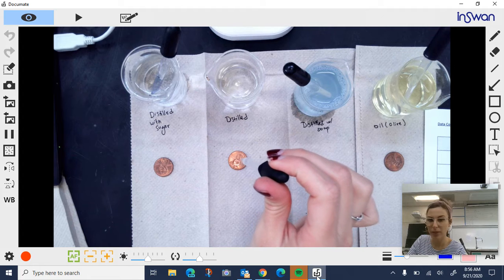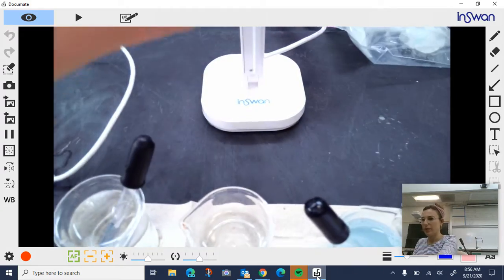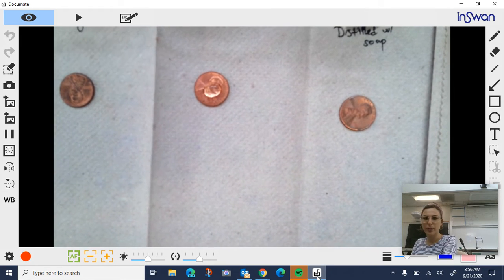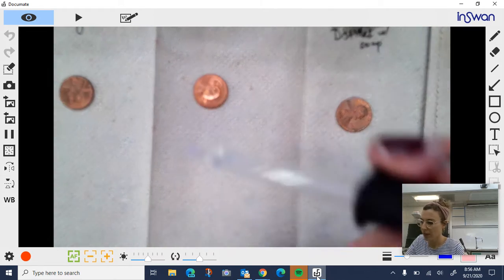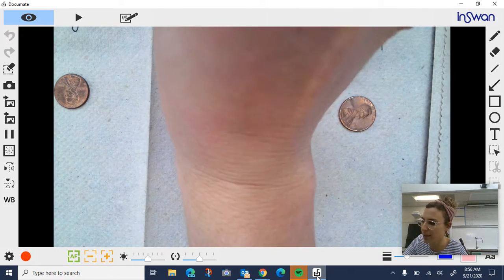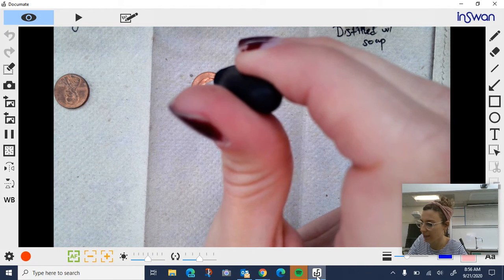One, two, three. You can already see, so we're at 4. You can already see cohesion between the water molecules. 5, 7. No, haven't gotten my 7th yet. Got to refill. 9, 10, 11.